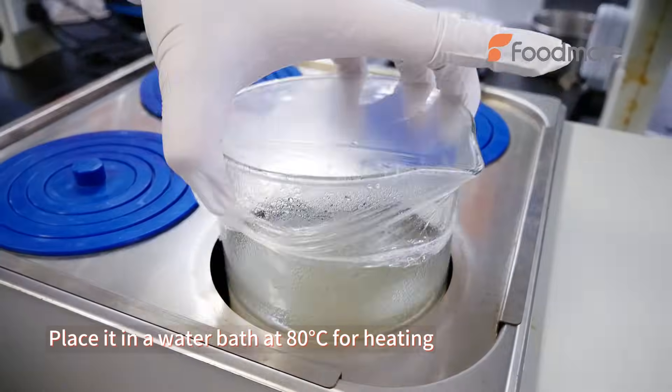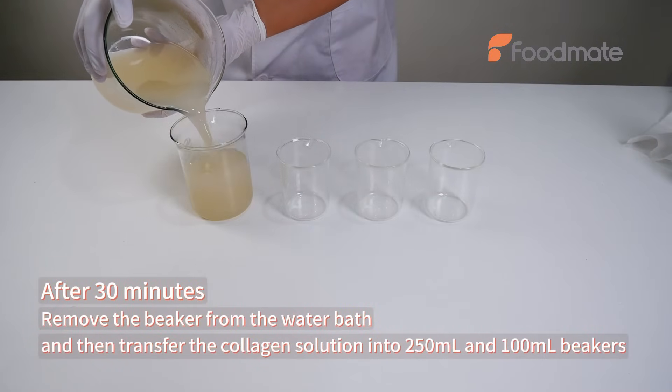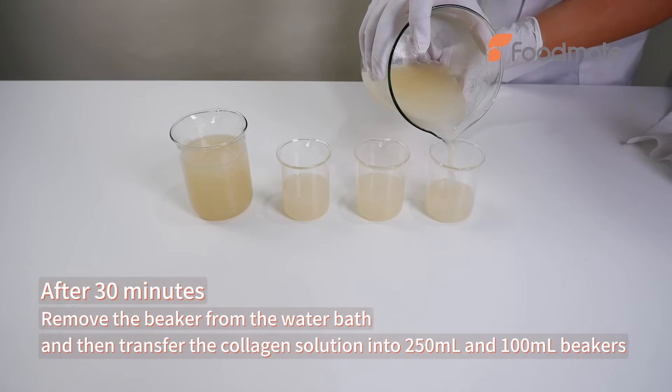Place it in a water bath at 80 degrees centigrade for heating. After 30 minutes, remove the beaker from the water bath and then transfer the collagen solution into 250 ml and 100 ml beakers.